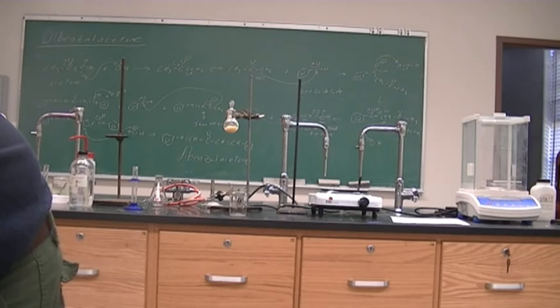We're at 102, no melting. We're at 103, no melting.